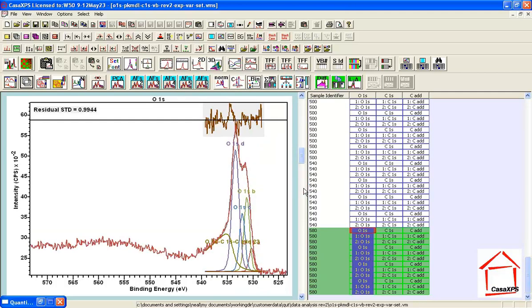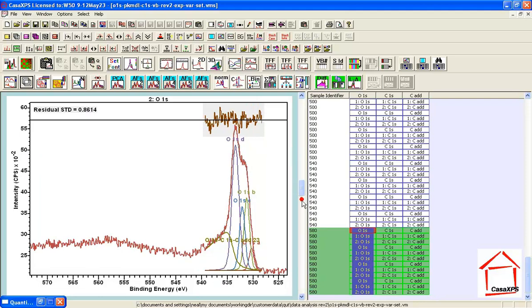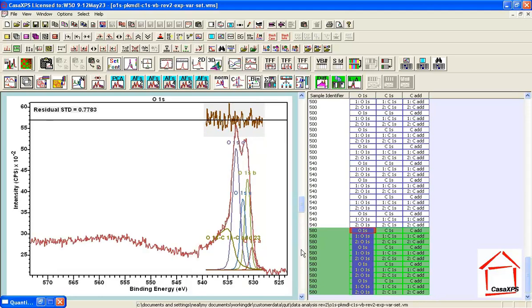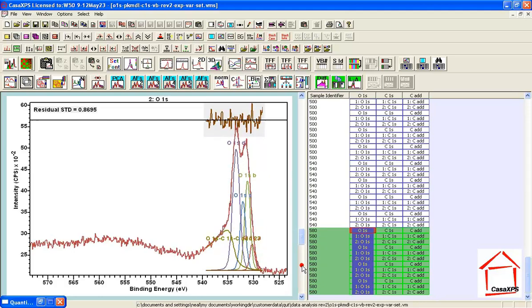Let's apply that fit to all of these by propagating — this time saying 'fit' because I believe the fit will make sense. Displaying in the scroll list, looking through shows the fit has performed a reasonably good job on all of these data — some very well indeed. A very good mathematical solution for the samples heated to 580 degrees.